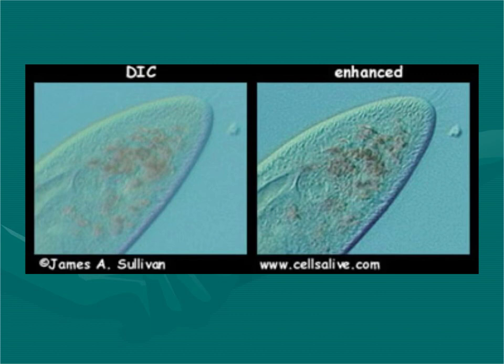This is an organism called a paramecium. Paramecium are single-celled organisms that live in pond water. So if you were to look at water from a pond or a lake under a microscope, you'd probably see some of these guys swimming around. You might notice they kind of have this fuzzy edge. That's because they have structures called cilia that help them to swim around and to move so that they can collect food and things like that.